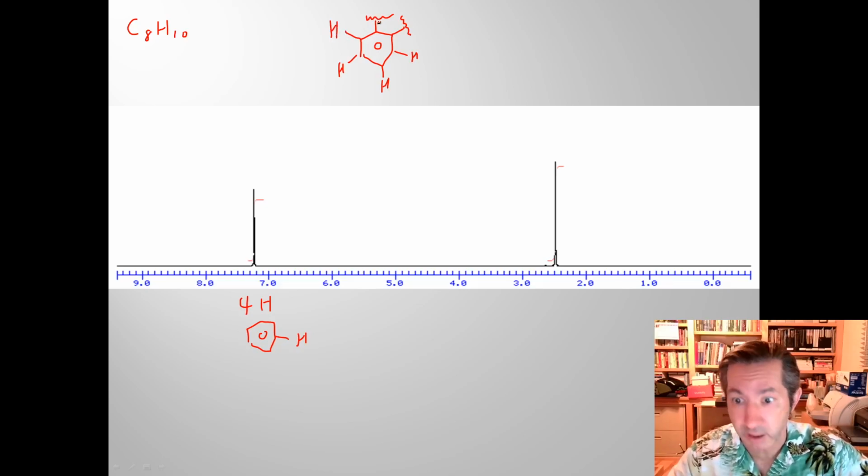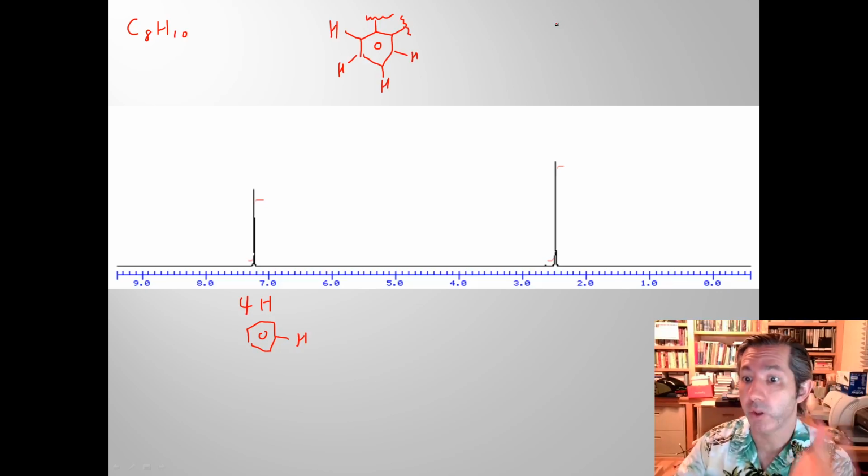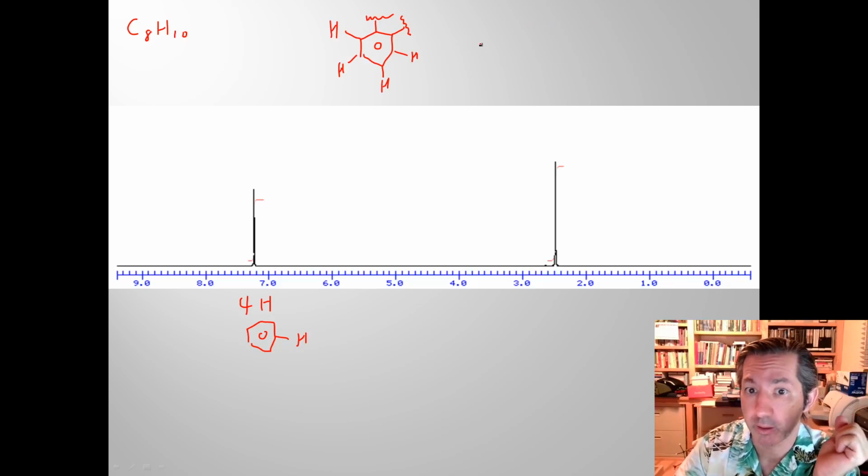And you'll have 2 things that are not hydrogen. Remember, we have 6 spots on these rings. And so you can have those two substituents next to each other. They could be a little bit farther away or a little bit farther away. Those are your 3 possibilities for that puzzle piece.